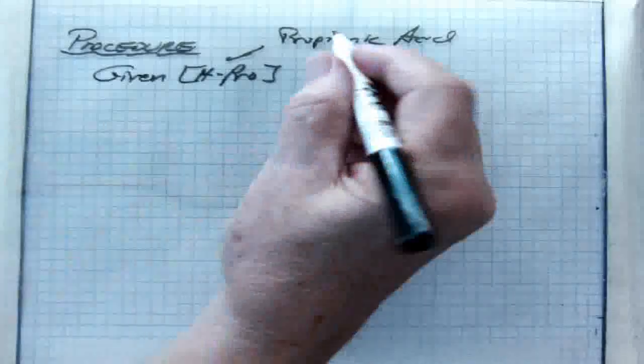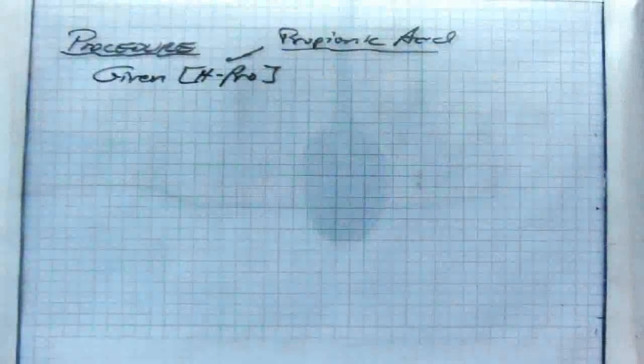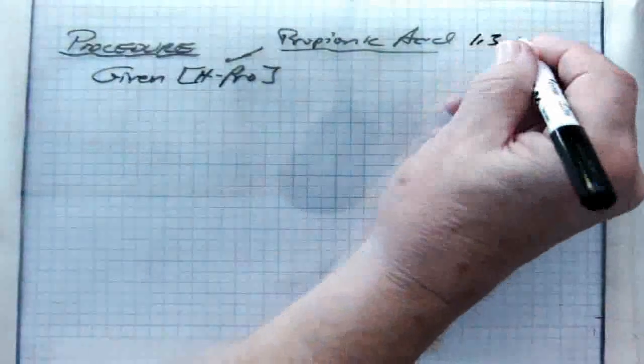Using equivalence point volume, divide by 2 to get the VEQ over 2.